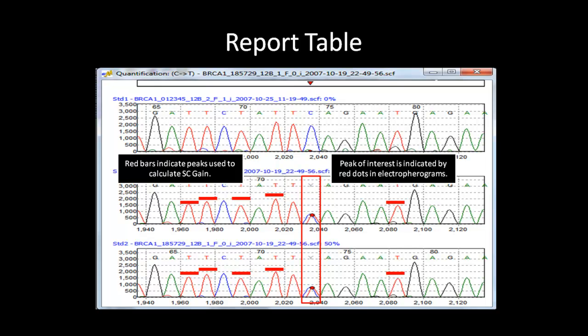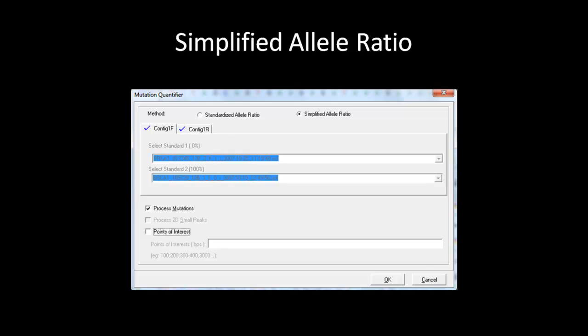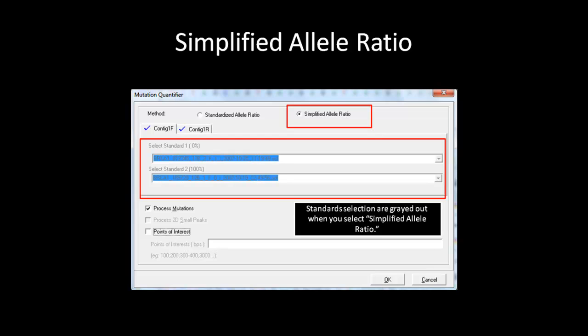We will now move on to the simplified allele ratio. When you select the simplified allele ratio in the dialog box, the standard selection drop-down box becomes grayed out. The simplified allele ratio does not require standards in order to quantify the variation. It simply uses the GenBank SEQ or reference file, depending on what type of file is loaded, to determine what is the normal allele and what is the mutant allele. It then uses the peak intensity in the sample to calculate the percentage of mutant allele versus the normal allele. You still have the option to choose between points of interest or process mutation. After selecting the desired options, click OK to generate the report.